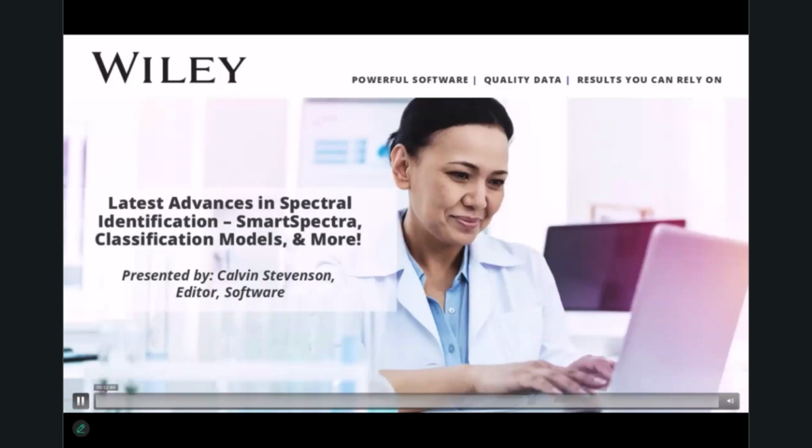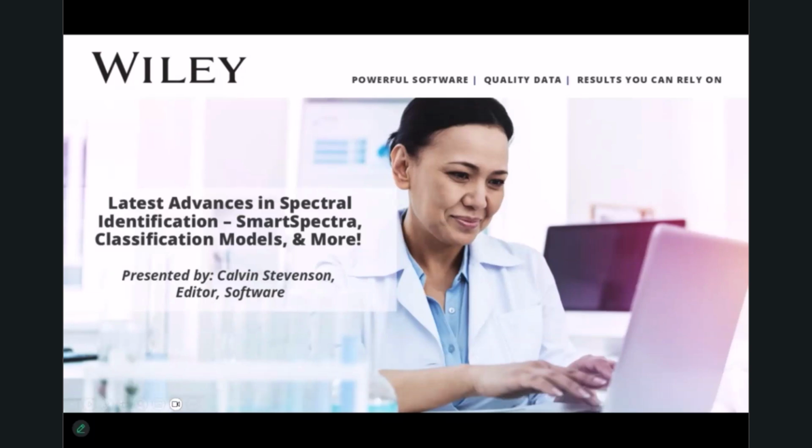Thank you for that introduction. In this presentation, I will be exploring the latest advances in spectral identification, specifically SmartSpectra, classification models, and Analyze It within the KnowItAll software.